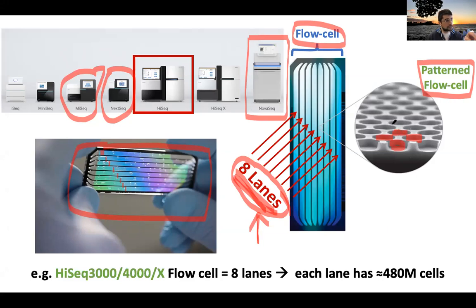So this was introduced in the HiSeq and the NovaSeq type of sequencing machines. The advantage is that this allows you to sequence in a much faster fashion. The drawback of this, we're going to see later today. We're going to have problems using this format because of index swapping. But we're going to talk about this specific problem later on.